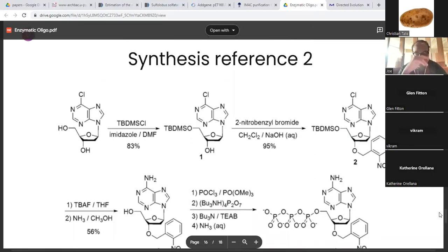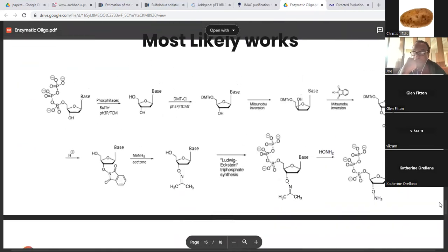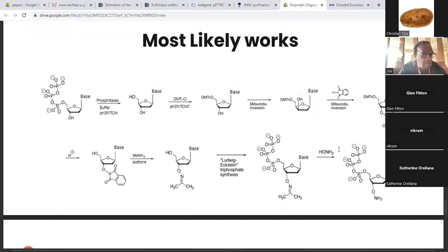Plus it's a lot bigger than the blocker that I'm looking at. So you'd have to do a lot of work with TDT to even have a prayer of being able to get it to accept this group. So yeah, the pathway was modified over here, and I was able to save a couple of steps.